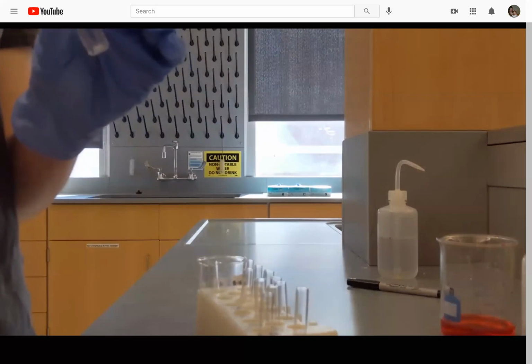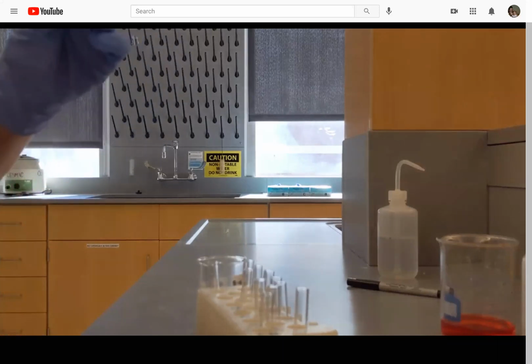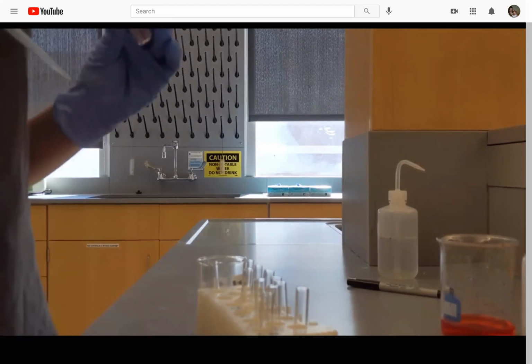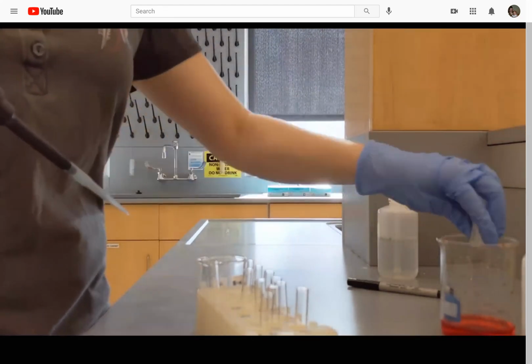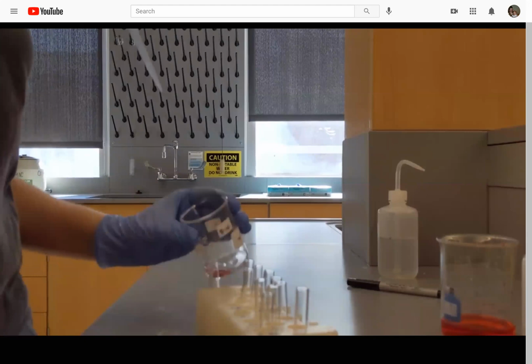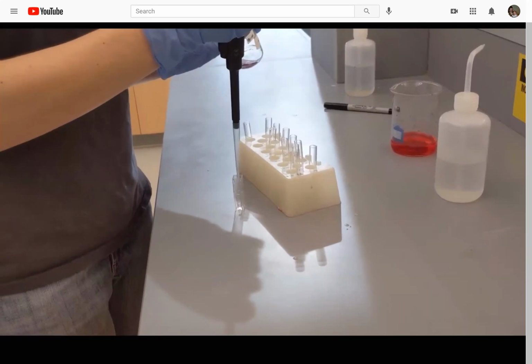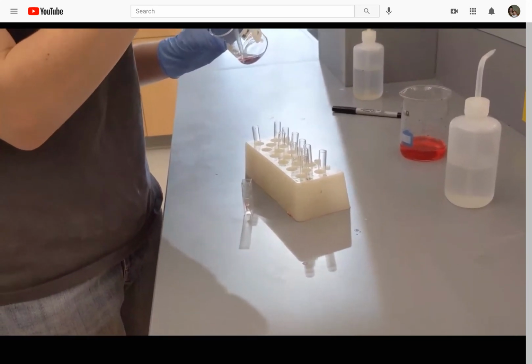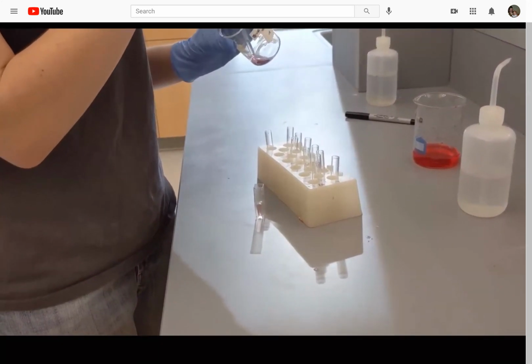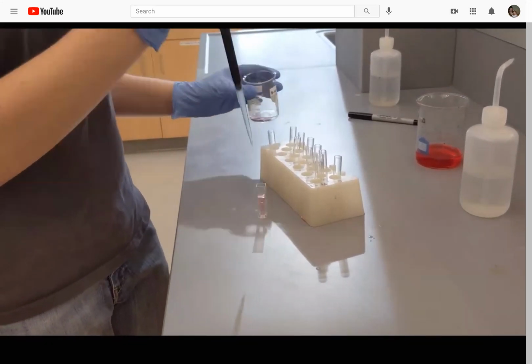Something to note is you want to rinse the cuvette with a small amount of your solution, making sure you get the sides wet prior to putting the solution into your cuvette to test it in the spectrophotometer. Now I'm just going to measure the absorbance the same way that I measured the standards and record that absorbance value. Should be good.